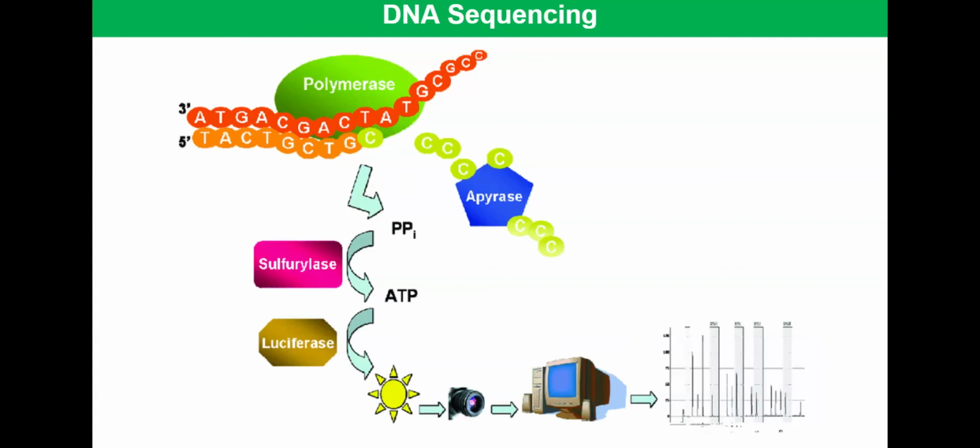This video tutorial looks at pyrosequencing. In the first decade of the 21st century, a variety of approaches were used to develop fast, cheap methods to sequence genomes. One of them is pyrosequencing. This method was developed in 1996 and uses sequencing by synthesis, not by chain termination, as in the Sanger method.